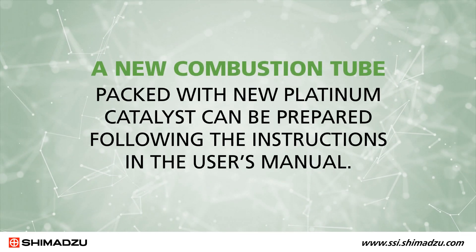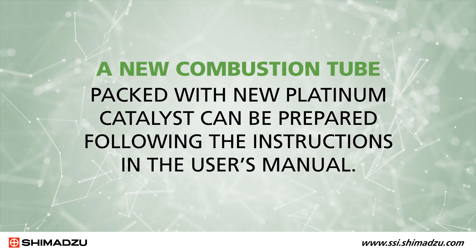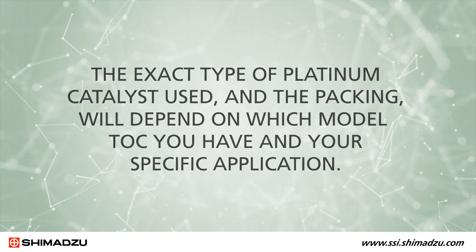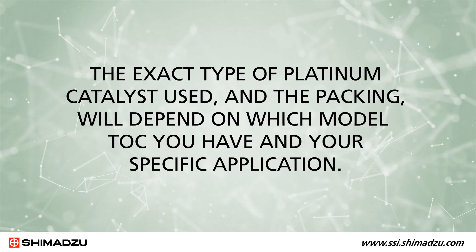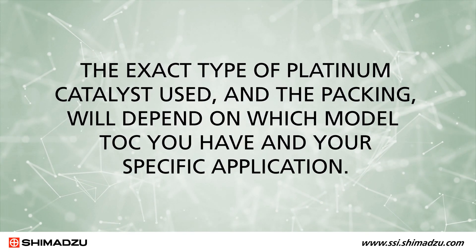A new combustion tube packed with new platinum catalyst can be prepared following the instructions in the user's manual. The exact type of platinum catalyst used and the packing will depend on which model TOC you have and your specific application.